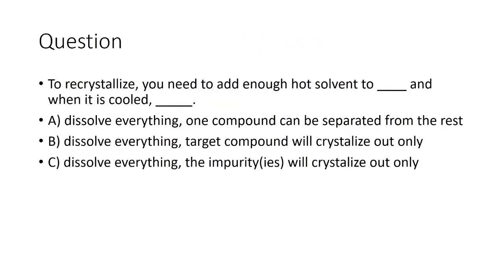So to recrystallize, you need to add enough hot solvent too. And then when it is cooled, what do you need to do? What's going to happen? Now, remember, like I said, this is not specific to this lab for this question. This is in general. The second part of the question, pay attention, look at what's in general going to happen. Not necessarily just this lab. In general, what is going to happen?